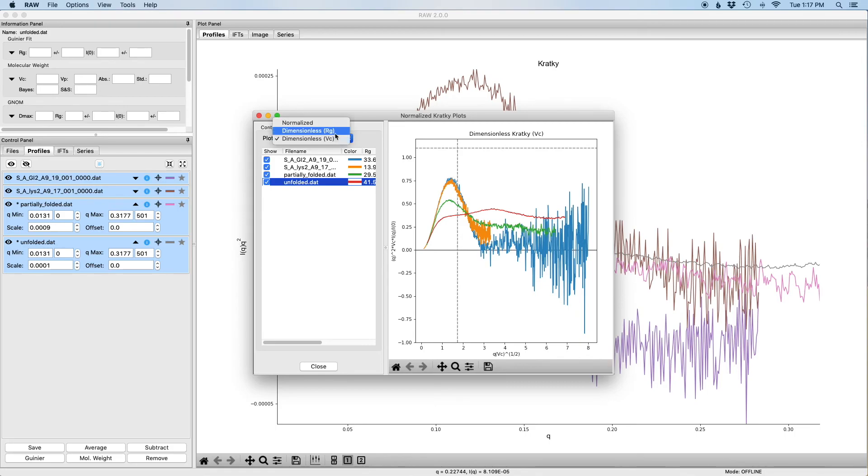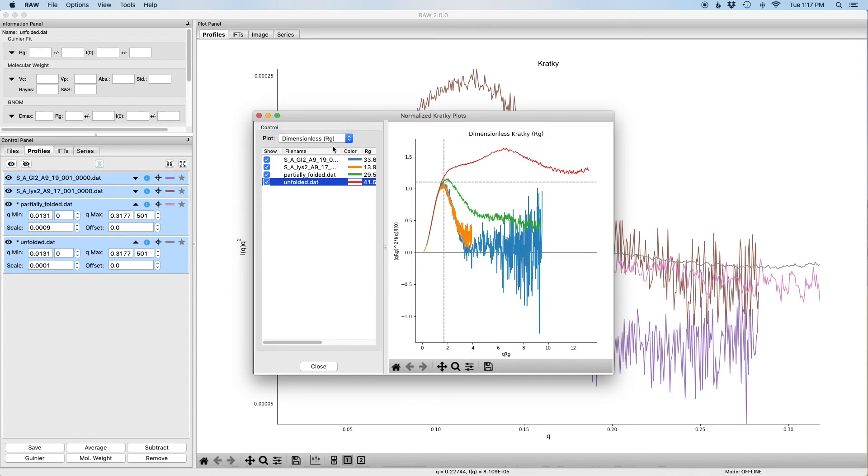This is kind of the usual approach. This is what most people plot is this plot.